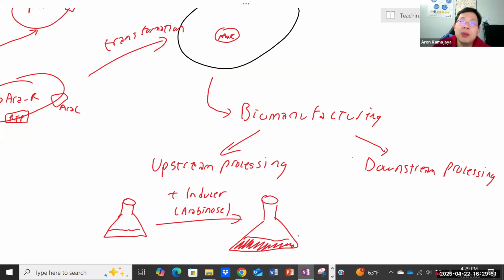Now, I already mentioned before, in this class we use red fluorescent protein because you can see it. So when you spin the cell down, you can see your cell is red, which is a good visual for us because we are still learning about this. But in the company, people don't express RFP. They express some drugs like antibody or something like that, nanobody, right? And most of them are colorless, so you can't see it. So in the real company, it's not as exciting per se.